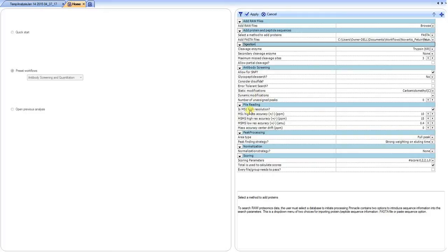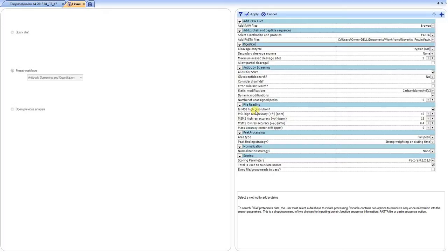And then of course you would set your file reading, what is your resolution expectations, whether it's high resolution in the MS, as well as the mass tolerance. Once you've set these few parameters, you would simply hit apply and it begins processing the data.